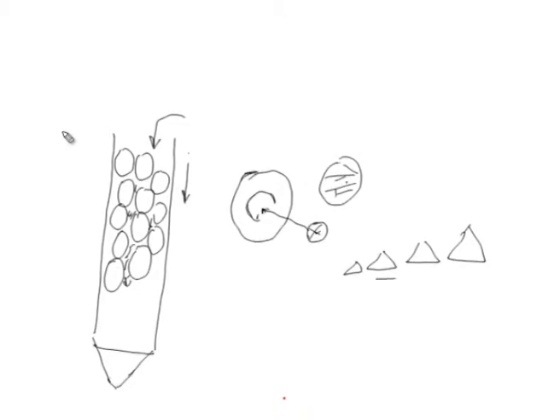Now, this system mostly cannot be run by gravity feed. So, you require a pump here, which is a very important part of this column, so that it can give you a constant flow rate. This is a prerequisite, that you should have a pumping system to run the column. You can put a reservoir over the column, but that will not give you a constant flow rate. So, in a simple method I tried to explain the principle of this gel filtration.